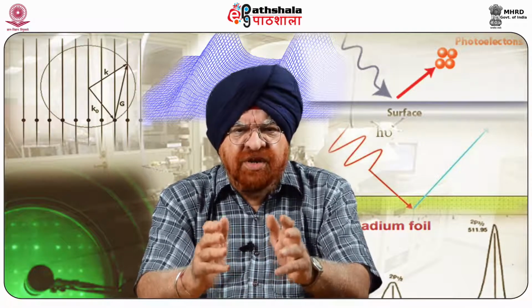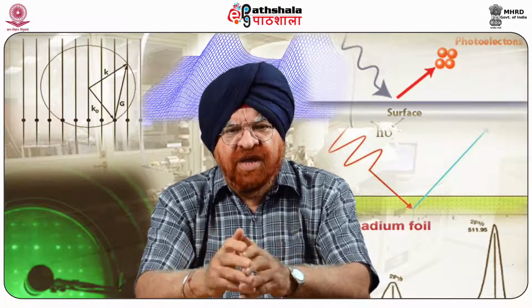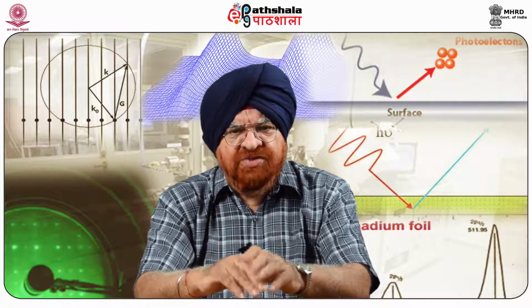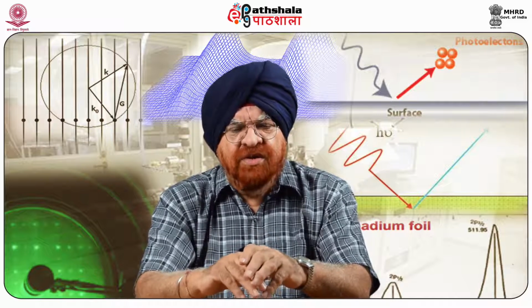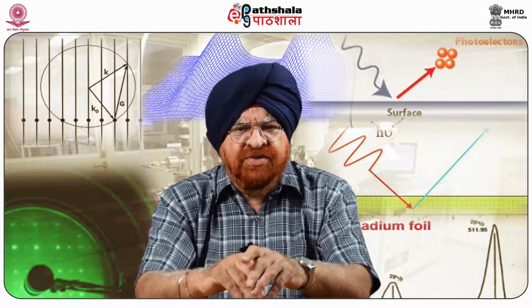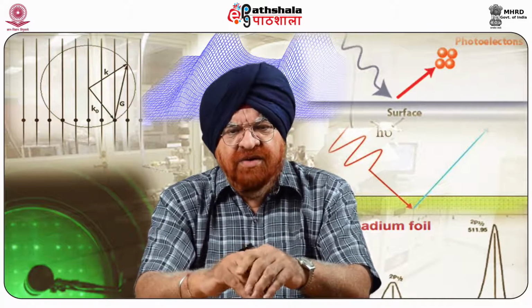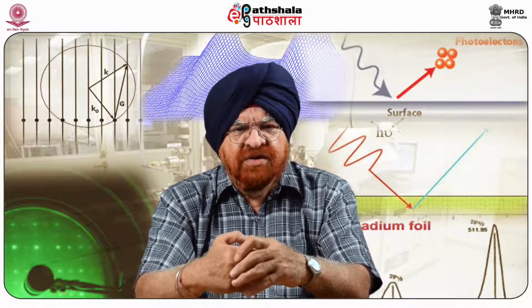The use of thin conductive metal coatings and replicas has made it possible for us to image some of the biological samples also, as indicated by recently obtained images of a DNA complex. A phospholipid bilayer sample or an enzyme crystal, for that matter, has been investigated with the help of this STM.